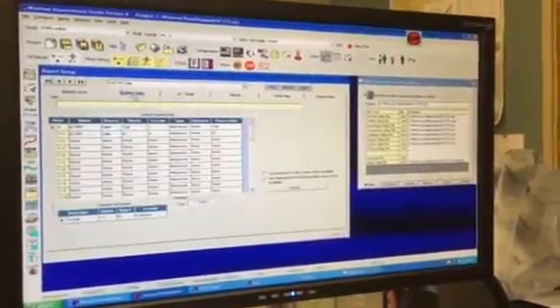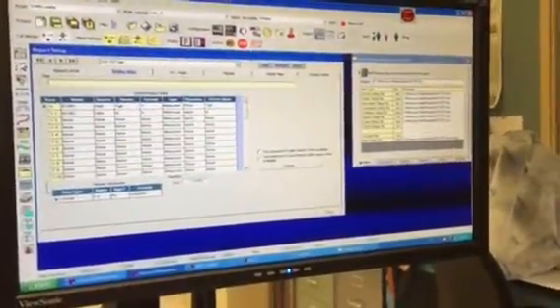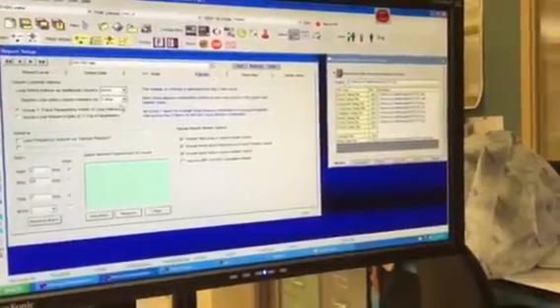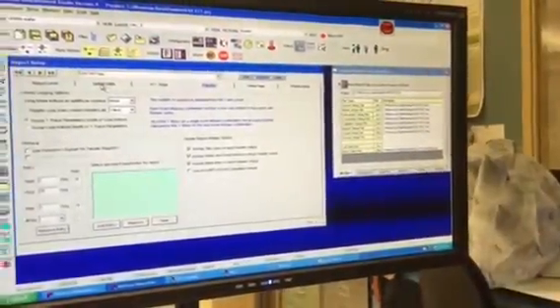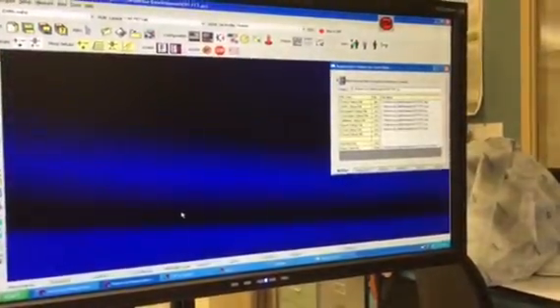Display plan. Okay. Yep. So why don't you go ahead and print that, just run that one the way it is, just for the moment, and see what it looks like. Not that's what you want, but now you just say view up top.